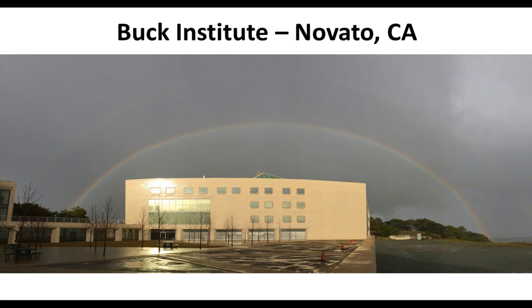Okay, so maybe I start with answering this. So yes, we definitely have a high interest in expanding the portfolio of one-pot enrichment antibodies, or adding other PTMs to it. In fact, the ones that were asked about specifically, ubiquitination and methylation, would fit very well for adding them into the one-pot enrichment.